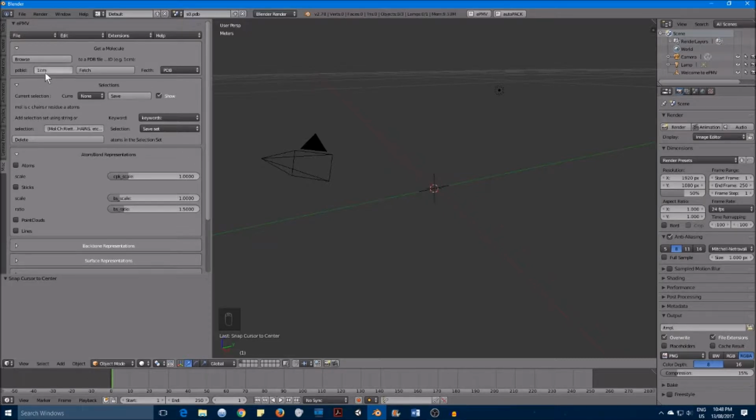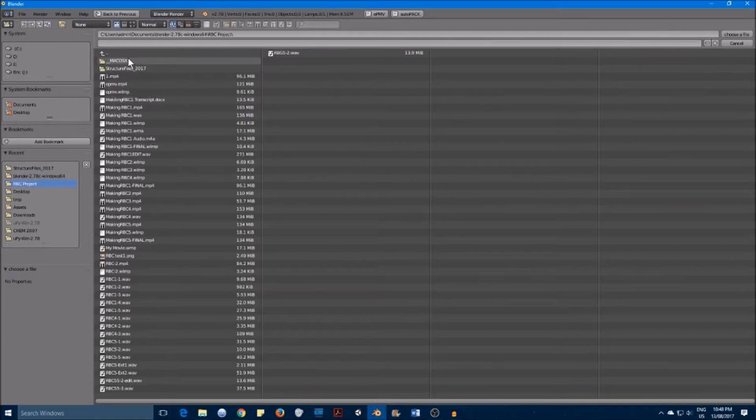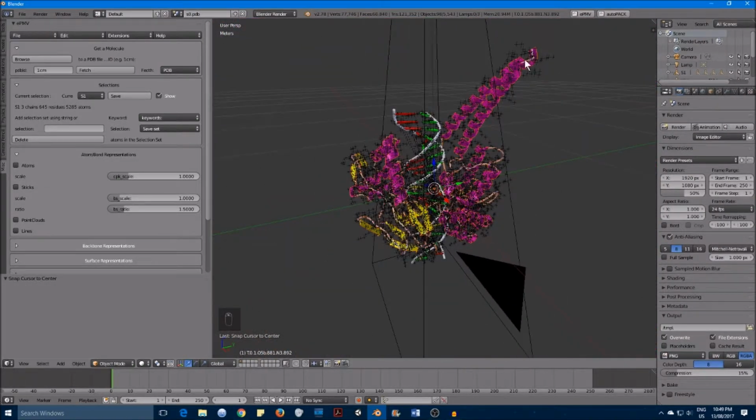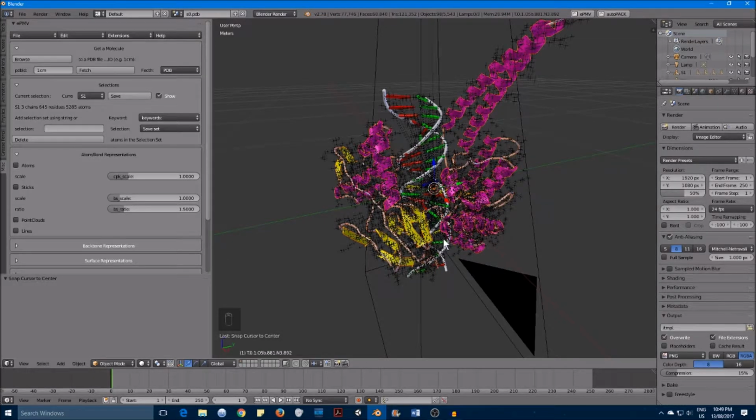And to show you, if we've downloaded one, I'll go on Browse. Here we go here because I've stored it here. For most of you, it should be in Downloads folder, so just double click that file. Alright, look at this impressive structure here. So what we're seeing now is a ribbon representation of our protein, and in the middle, some DNA.